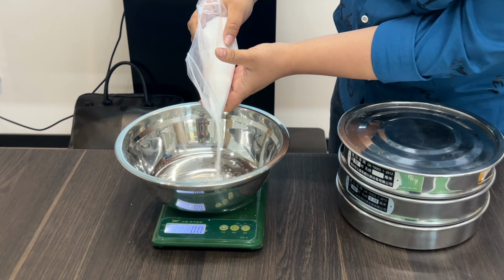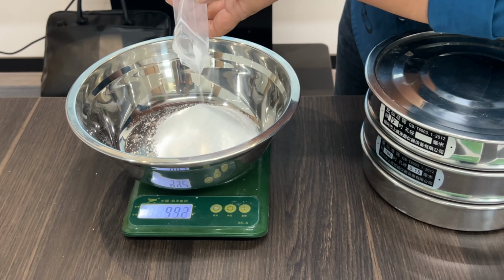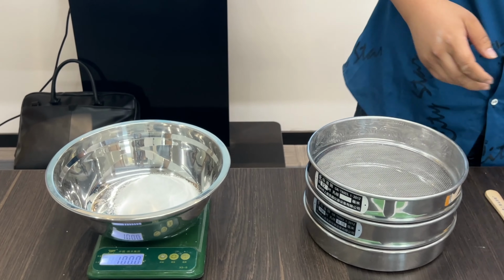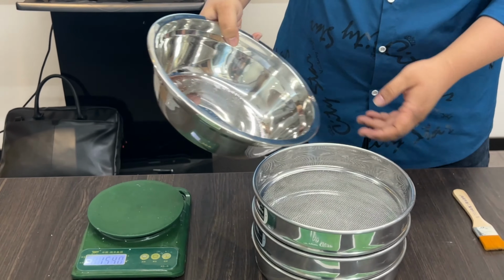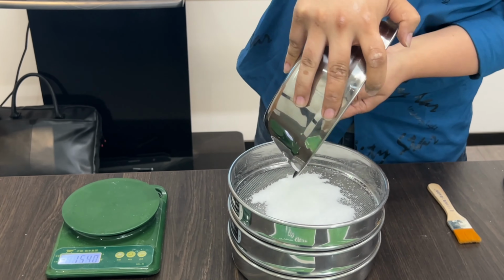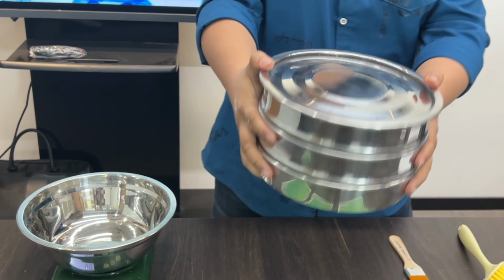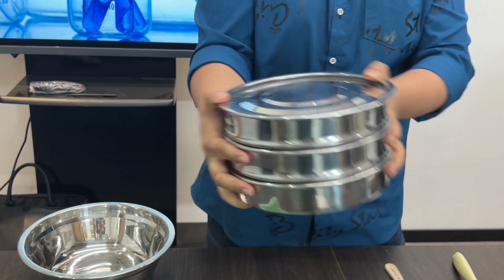We measure 100 grams. Yes, 100 grams. We put the sample into the sifter slowly. Put on the cover. Swing the sample side by side for 10 seconds.